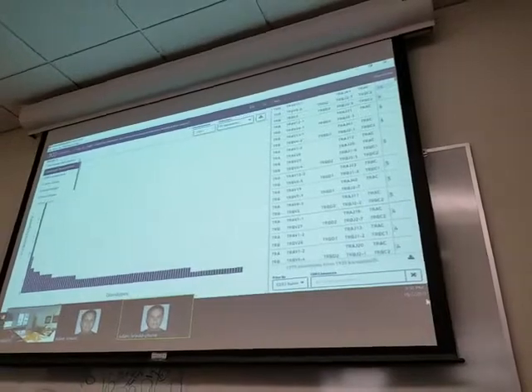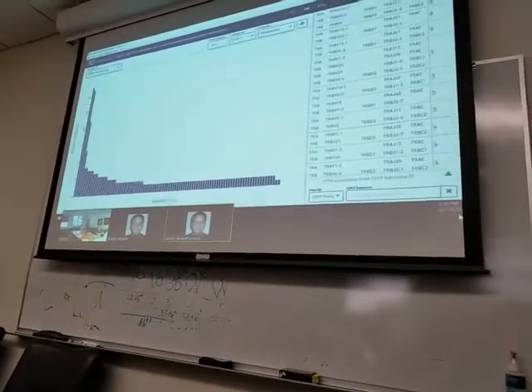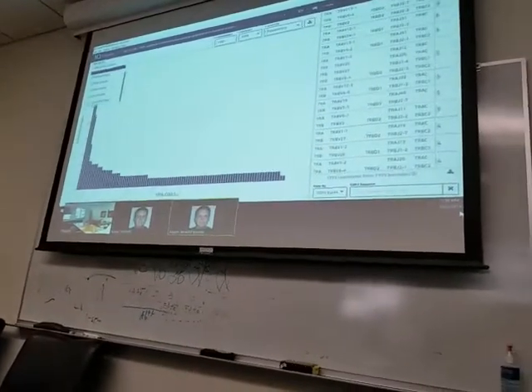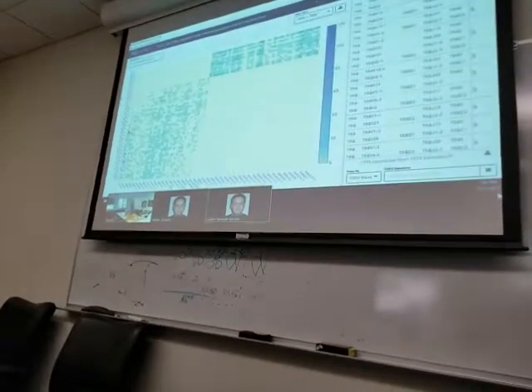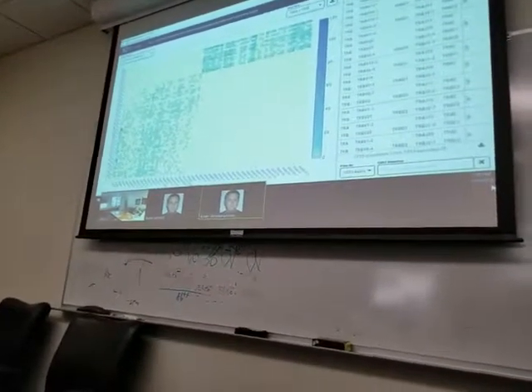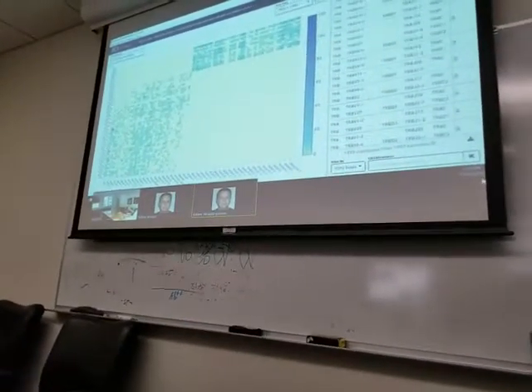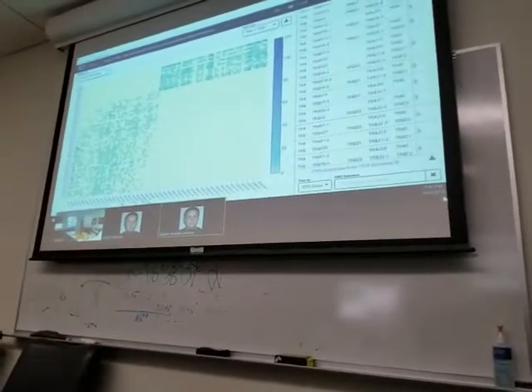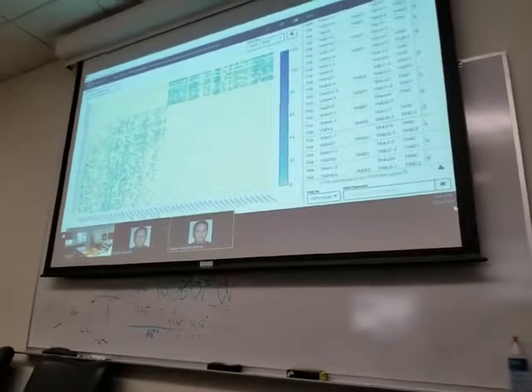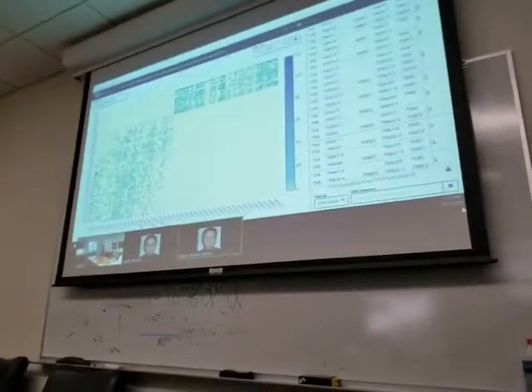What we do have is, and I don't know the name of this plot, find it here. We do have this view, which I believe some other tools use, if I'm not mistaken. But yeah, we don't have any clustering for VDJ. I can put that in as a feature request. Do you know what's the best software or best way to make that kind of figure? No. He's going to look into that. Yeah, I don't.